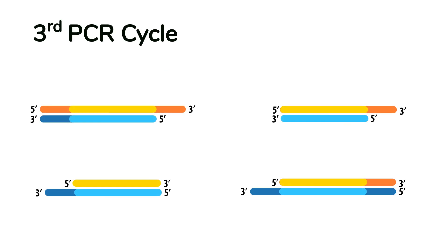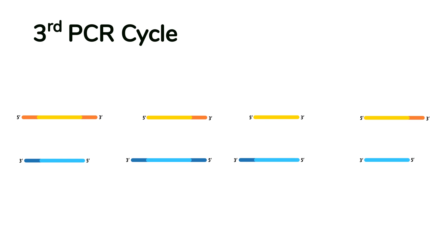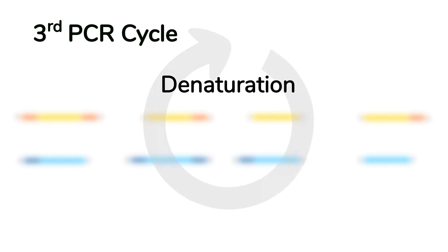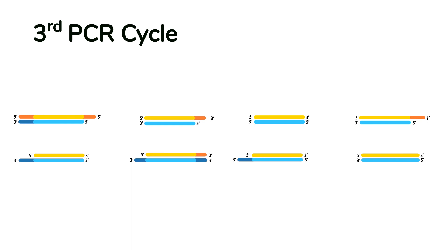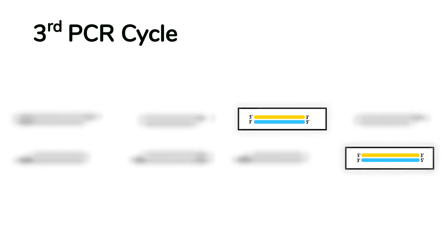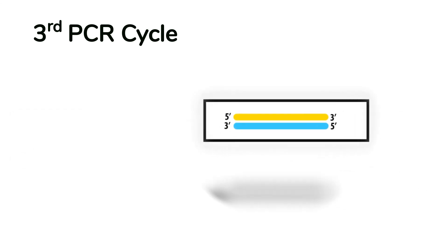Third cycle. These four different PCR products provide eight templates for cycle 3. After going through the PCR cycle a third time, we end up with eight double-stranded PCR products. Two of them finally exactly match the double-stranded DNA segment we wanted to amplify.